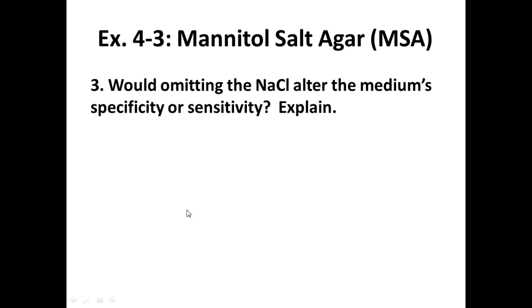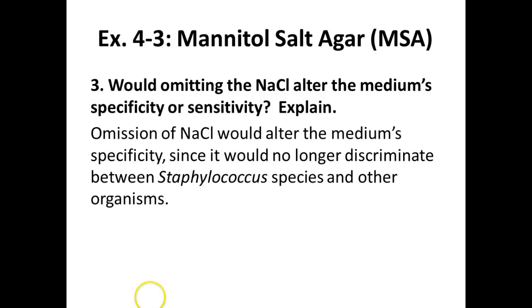So would this affect the media's specificity or sensitivity? Specificity, right? Because we're no longer selecting, we're no longer being specific as to what we're looking for. So it would be messing with the specificity of this media.